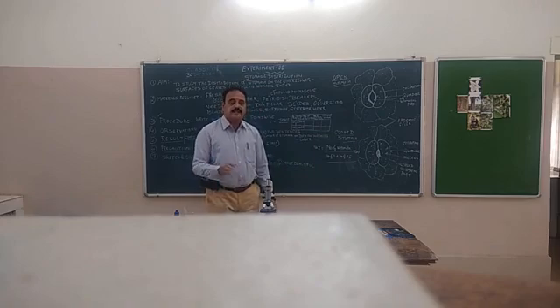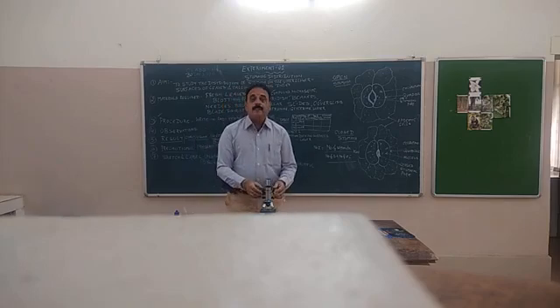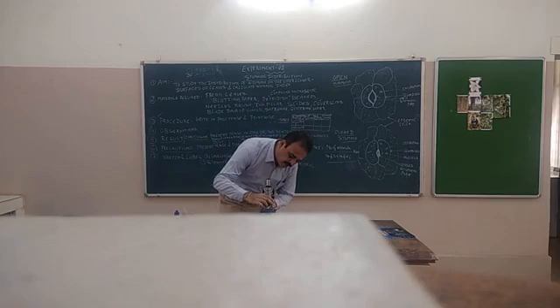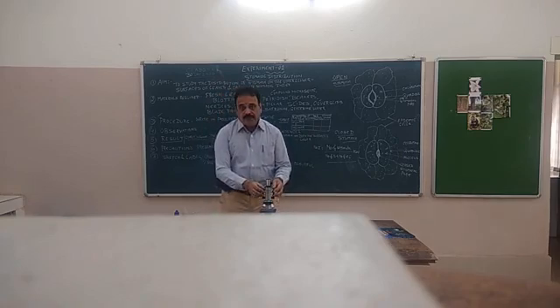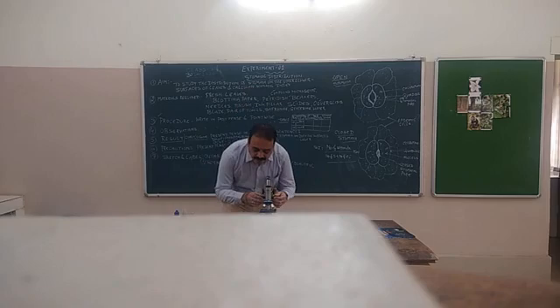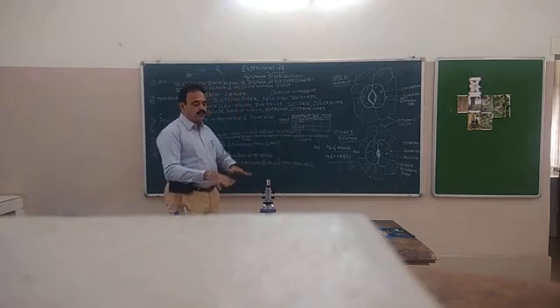So carefully separate it. And the most important one is, when you place it under the microscope, particularly on high power, the gap between the slide and the objective lens will be so narrow. I am demonstrating that to you. You can see here. Virtually, you can see the gap is very narrow. So if you operate the rough adjustment, there are chances of the slide getting broken. Hence, under high power, you always need to operate with the fine adjustment, not the rough adjustment. This is another precaution.